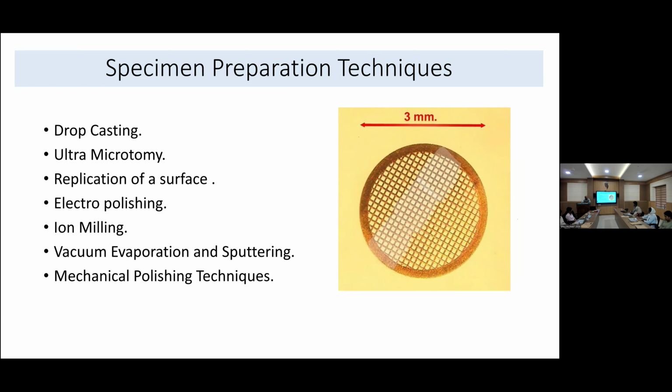And we cannot load wet sample inside the TEM. Because of this, we cannot get wet samples. Only dry samples are allowed. If you have some liquid samples, then we will prepare this on the grid and then dry it. Okay, and then only analyze inside TEM.